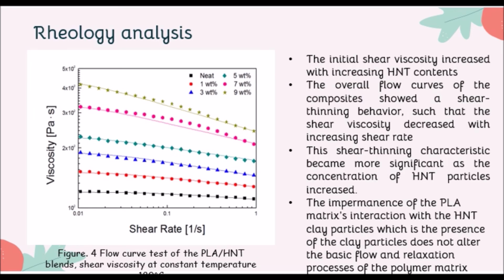And the last one is the rheology analysis. So you can see based on this figure, which is the flow curve test of the PLA/HNT blend, the shear viscosity at a constant temperature of 180 degrees Celsius. The initial shear viscosity increased with the increasing HNT content. The overall flow curve of the composite shows a shear thinning behavior, such that the shear viscosity decreased with the increasing shear rate.